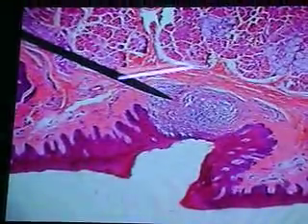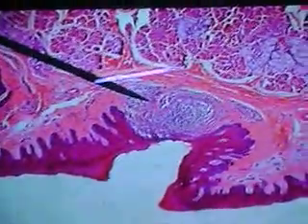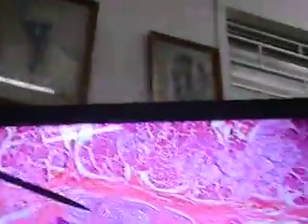Okay. Now this is just at the verge of going from the anterior. Students, I'm asking you, I need a couple more slides of the tongue, please. Some of you must have brought the slide boxes. Sean, help me out. Alright, just put your initials, please. I need a couple more slides of the tongue.